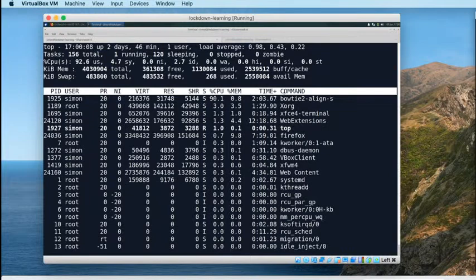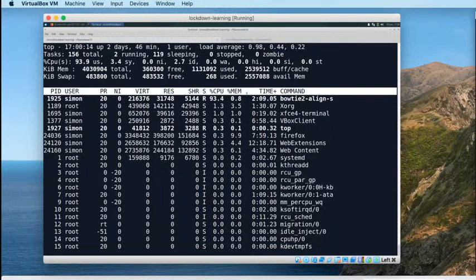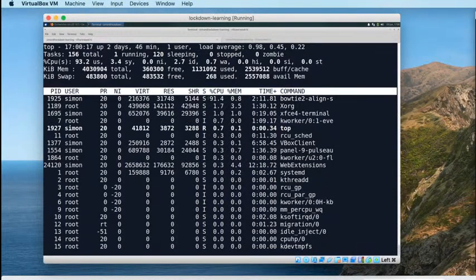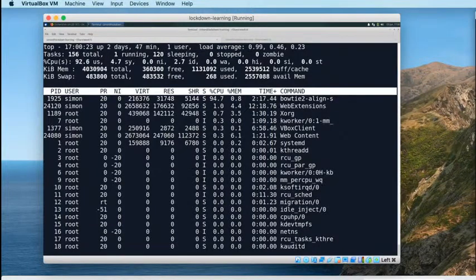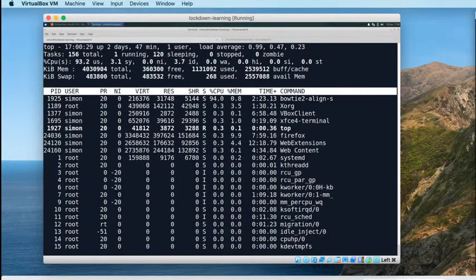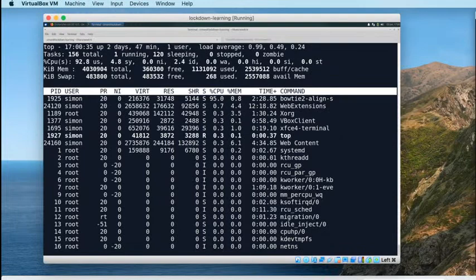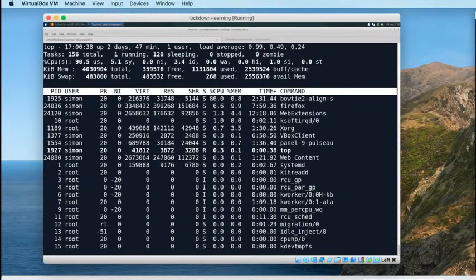Maybe 1.4 million reads on a VM is slightly more of a challenge than I thought it was. But it's whirring away, and it's going to produce an alignment, and it's not going to take an unreasonable amount of time. I'm going to need to stop this now and show you the alignment report tomorrow. I'm going to keep mugging to the camera for you until this is finished. So lucky you get to hear my voice rambling on for another few minutes while it's running.